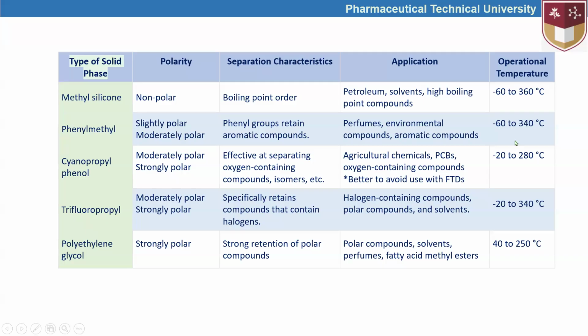Operational temperature is very close to the one provided with methyl silicon, which ranges from minus 60 to 340 centigrade.